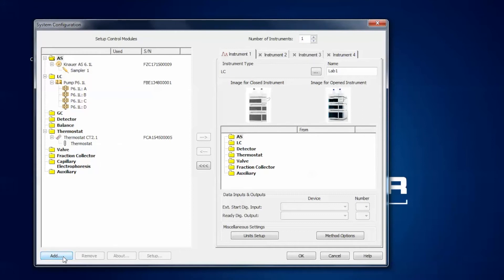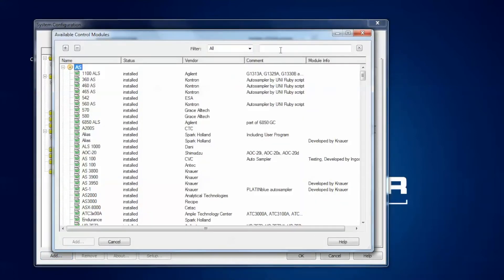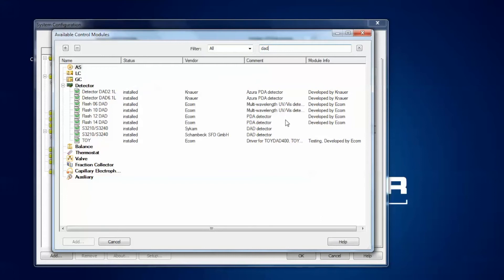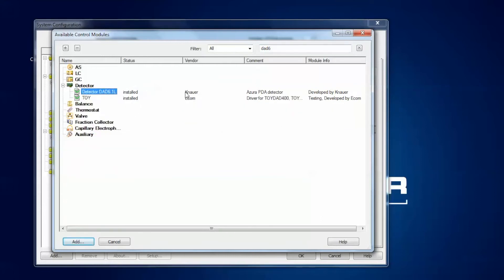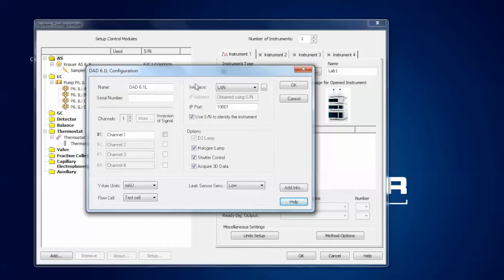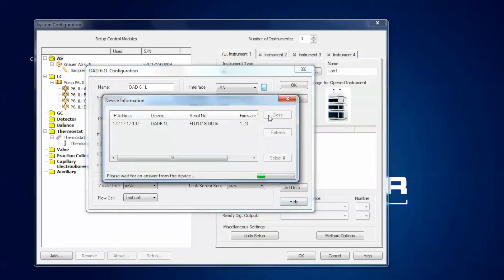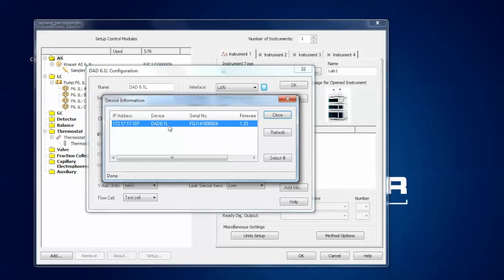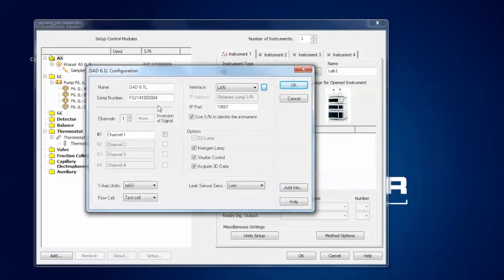Last but not least, there is the diode array detector to configure, which is a bit more challenging than the previous devices. Type in DAD6, select the respective entry and click add. The configuration window opens and looks more complex, but I click the auto-configuration button. The software finds the correct device — click the entry to select and confirm with the select button. It gives you the serial number but the rest you have to configure yourself. Here you can select how many channels to use. At the moment one channel is selected, but clicking the arrow shows more channels are available.